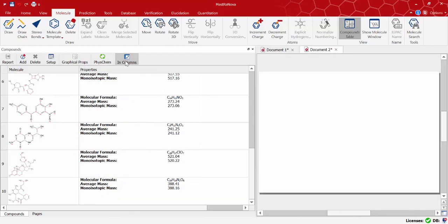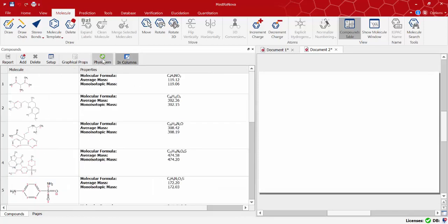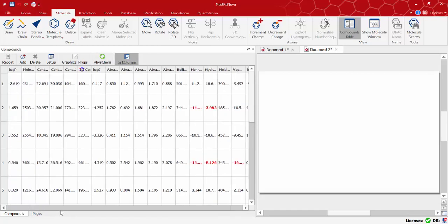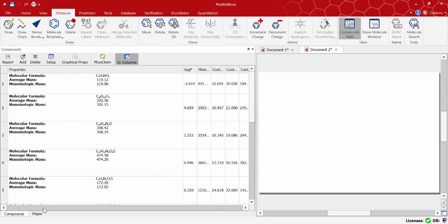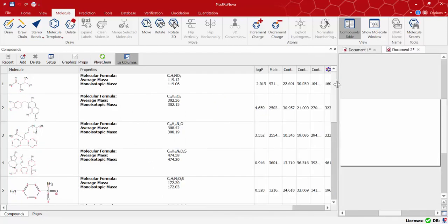Using the IN COLUMNS button we can display the properties also in columns. As we saw before you can select any of the properties and display the atom contribution.